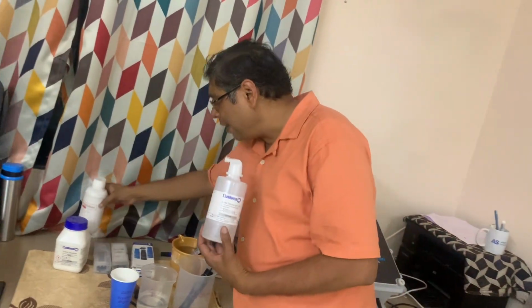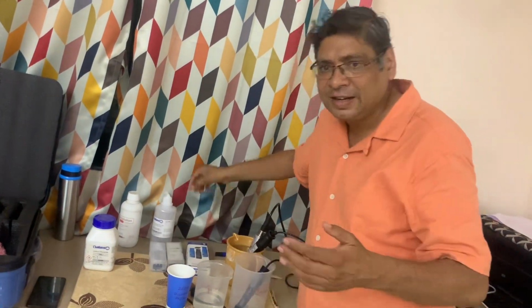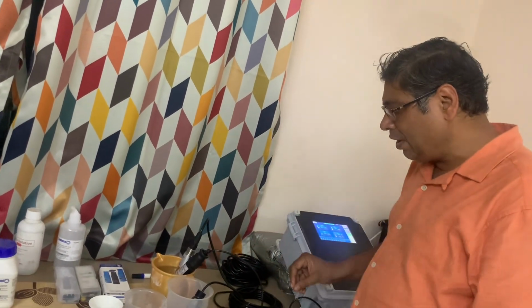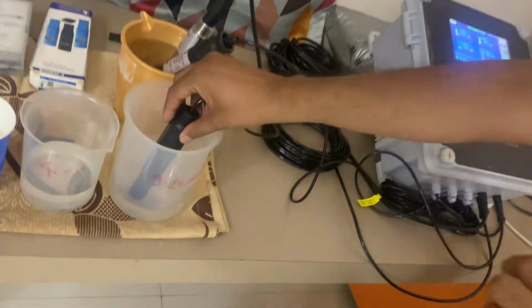We can do 1 point also, but in a pH analyzer we have to do 2 point because of the Nernst equation. We see this is a linear graph, and if you want to do proper calibration we need 2 points to get the linear y equals mx plus c, which we already discussed. So we will have this pH sensor. Right now, what reading is it showing?